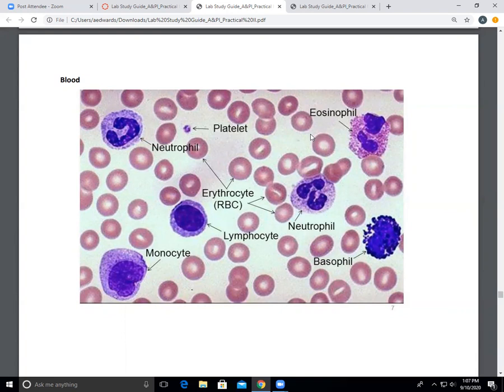You have neutrophils, which have sort of a backward C in there. Basically you've got different kinds of block shapes inside. If you have a big circle, it's a monocyte. If the circle's taking up most of the room in the cell, it's a lymphocyte. Discrete dots that are really dark, the basophil. If the dots are really small, it's the eosinophil.